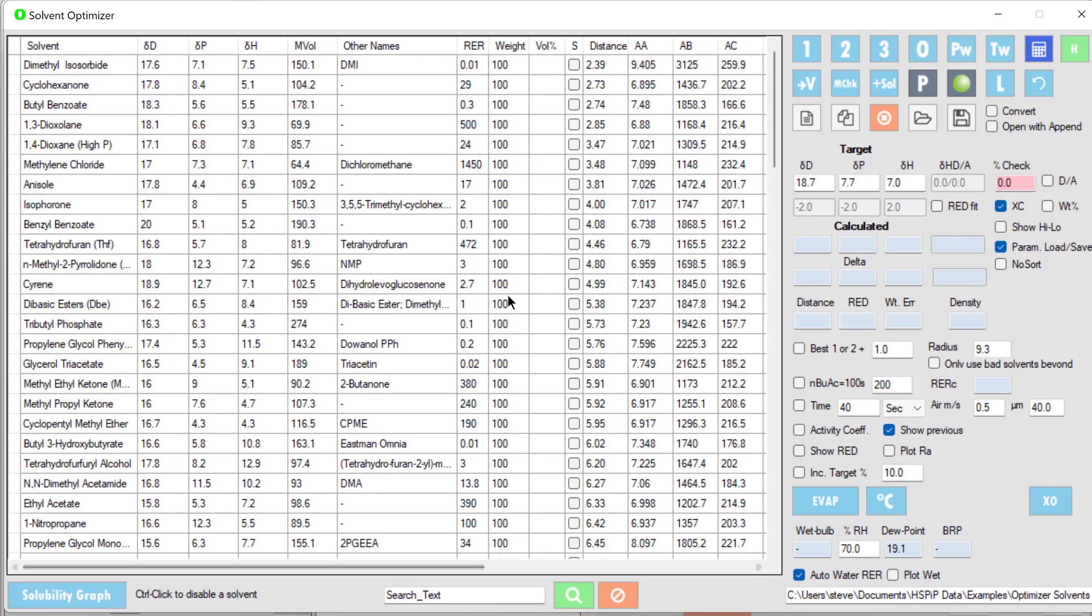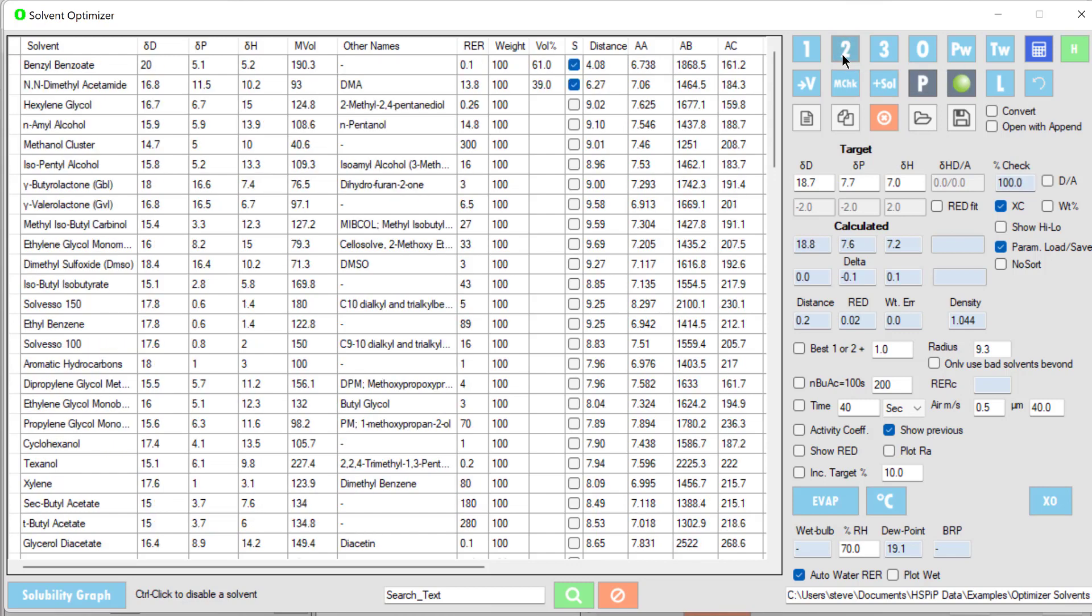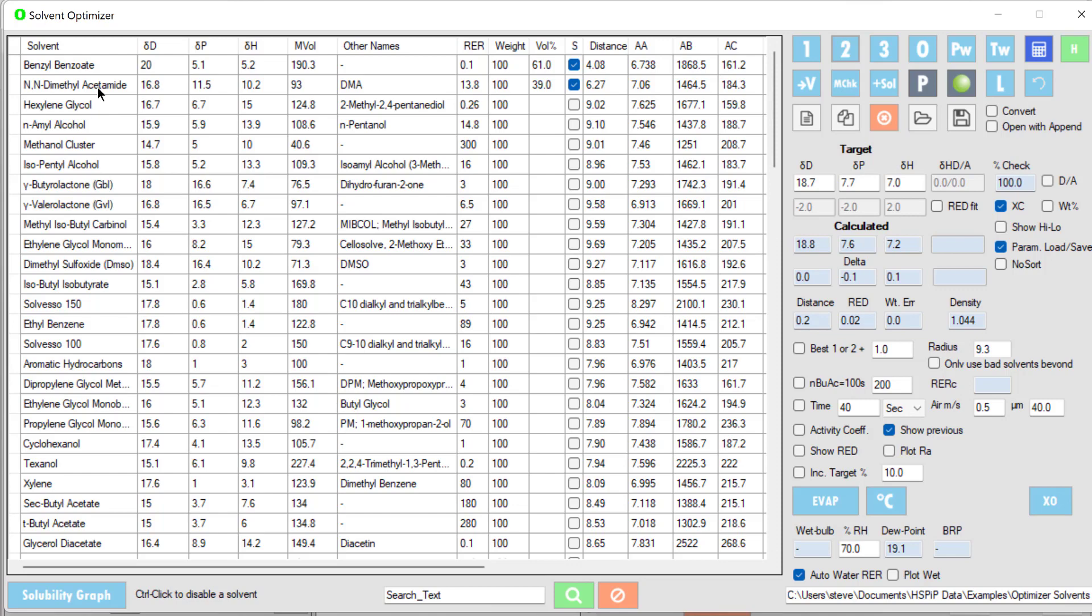None of these solvents on their own is ideal for us, so let's find a solvent blend. Let's find the two best solvents out of this list when combined in any proportion. We find that a 61-39 blend of benzyl benzoate and dimethylacetamide has a calculated value of 18.8, 7.6, 7.2, so it's very close with a distance of 0.2. Of course, you're not going to use dimethylacetamide, but this is showing the principle.